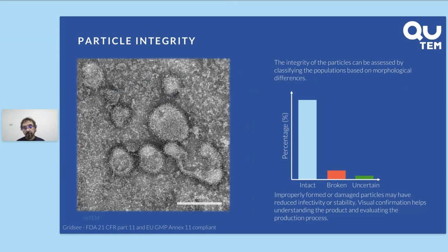And yeah, TEM is a very good method in that you can directly see your particles, so you can directly not only identify, but also easily characterize and classify them. So that's one thing that can be performed. Here I show an image typically using negative stain. Of course, one could think of doing the same with the cryo-TEM as well.